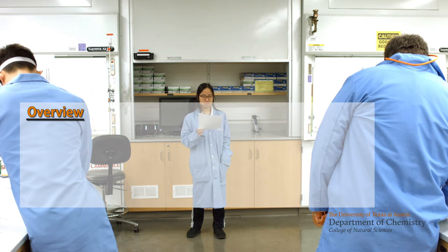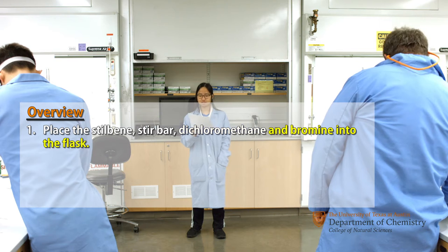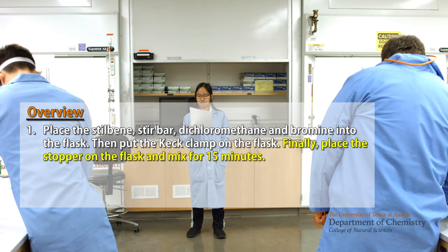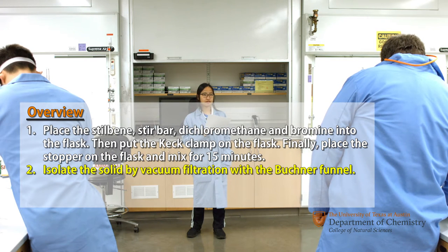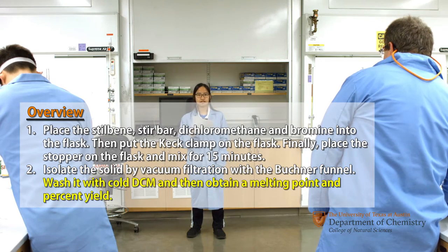Just to overview the experiment, place the stilbene, stir bar, dichloromethane, and bromine into the flask. Then put the Keck clamp on the flask, and then put the stopper on top. Then mix it for 15 minutes. Isolate the solid by vacuum filtration with the Buchner funnel and then wash it with cold DCM. Save it for next week.